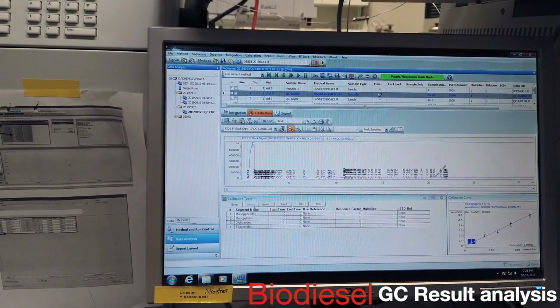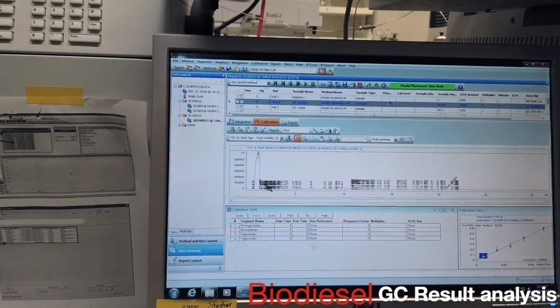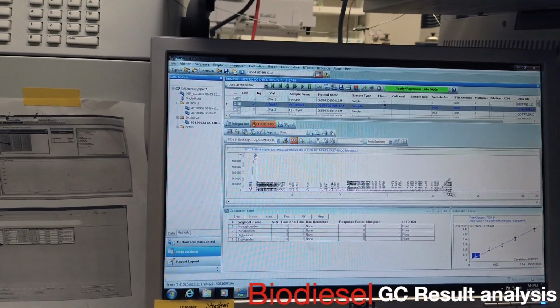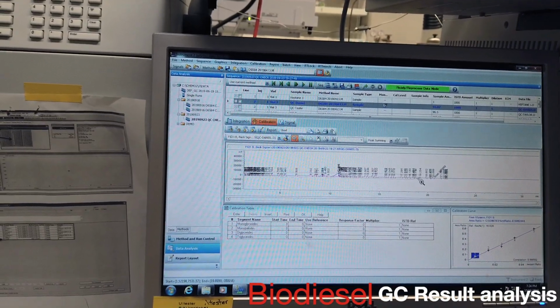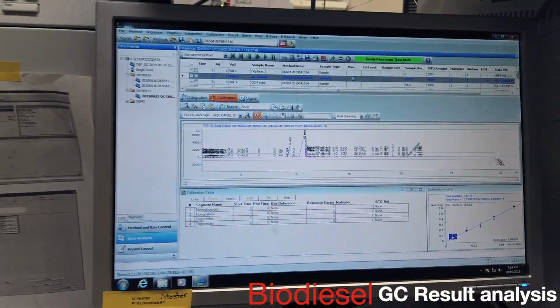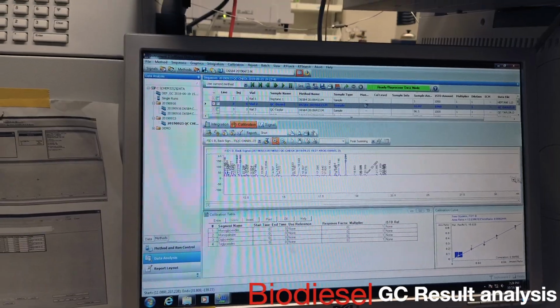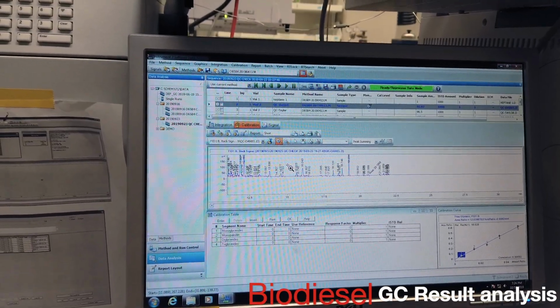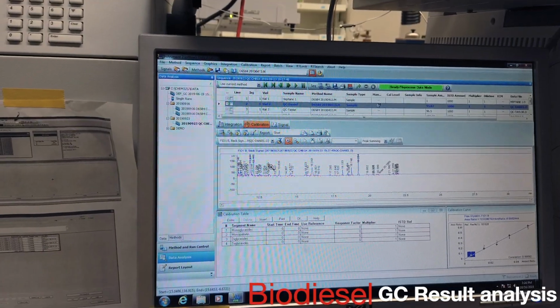Peak summing, and this gives you monos, monopalmitin, dis, and tris. So I'm going to zoom back in. Okay, this actually looks a little weird, but let's try to figure that out.